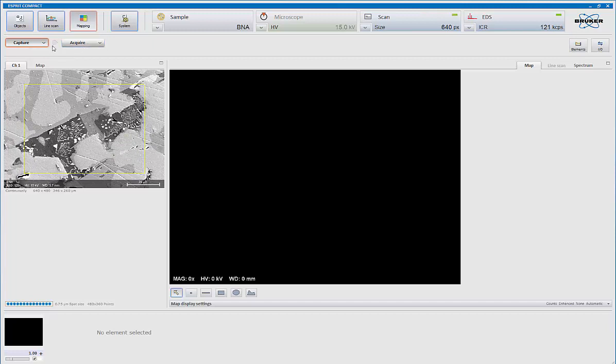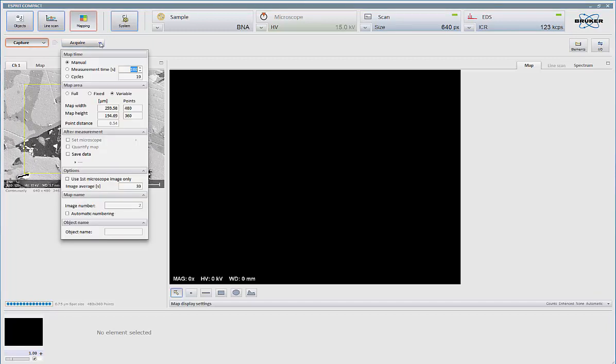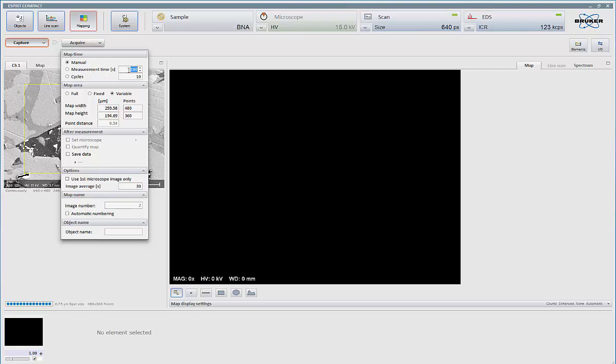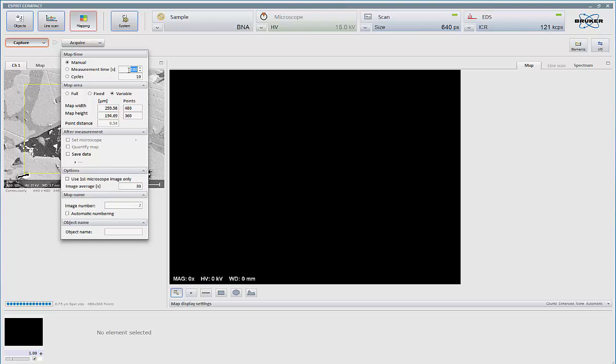On Acquire, that's to acquire the map. I have a choice of manually, in other words, keep collecting until I tell you to stop, based on time, and it'll finish the frame, so if the frame's taking 20 seconds and I tell it to collect for 130, it'll finish the frame completely, and then number of cycles or passes, how many frames I want to do.